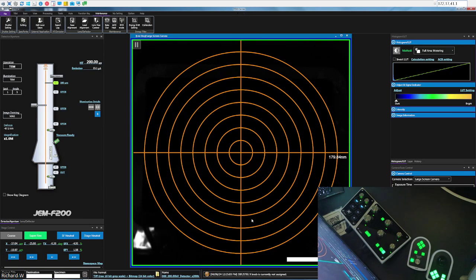microscope computer. For those unfamiliar, the microscope we're using today is the F200. This is the microscope you can see behind me. This microscope has been at UNSW for 7 years now, and it's still working like the day it was installed.